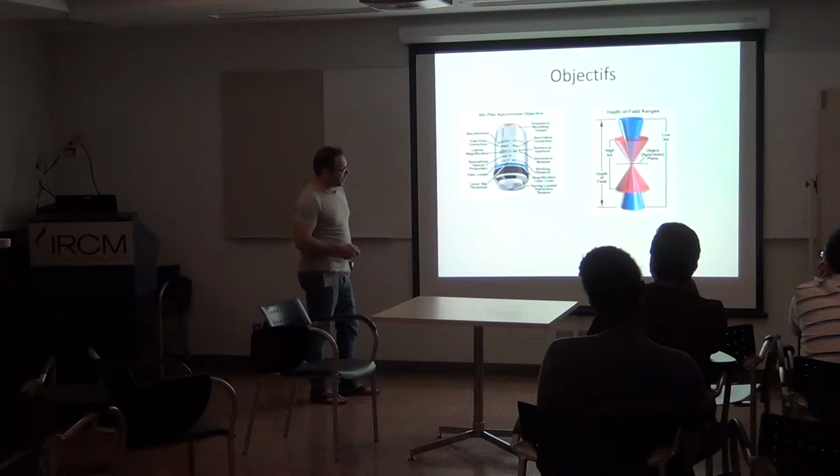Okay? And so this goes also with the size of the diameter. Let's say you look at a certain thing, you have your object which should be here, and the focus is really here. But let's say your object emits some light from there.